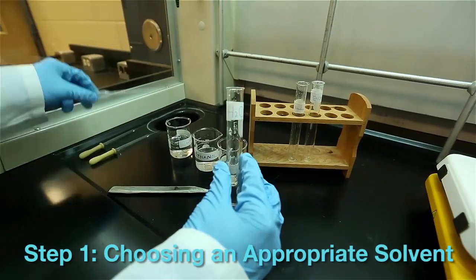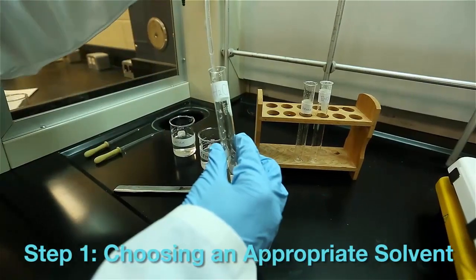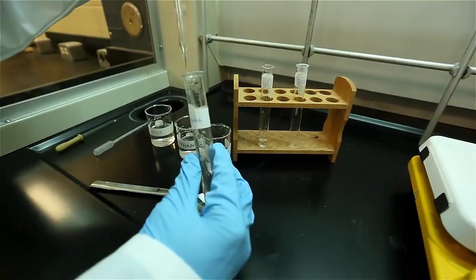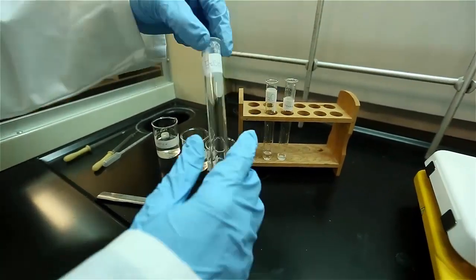The first step in recrystallization is finding the right solvent. This will involve adding a bit of the solid sample into each solution and then observing to see if the solid dissolves in the solvent at room temperature.